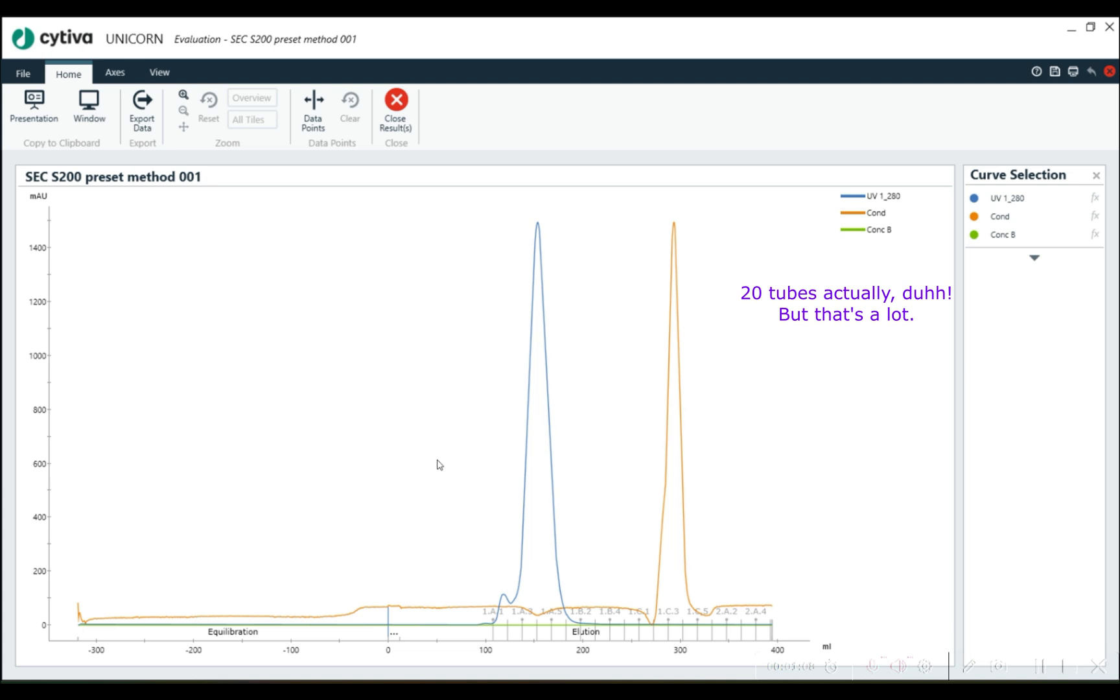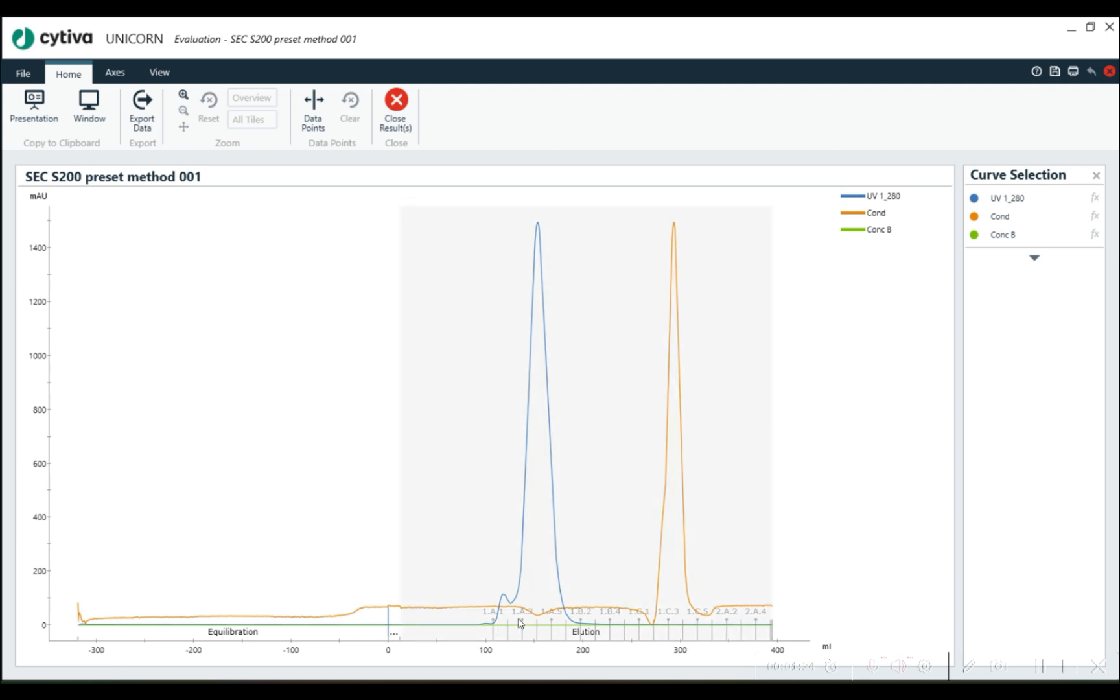If we want to be able to save these tubes and use our space more efficiently, especially if we're going to be doing a bunch of runs using a method editor and scouting, a bunch of runs back to back, we want to be able to have a nice tight fractionation.